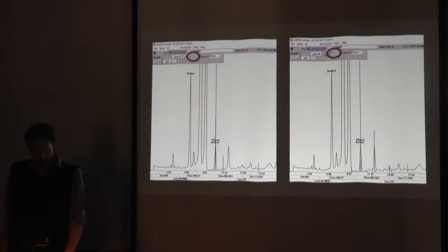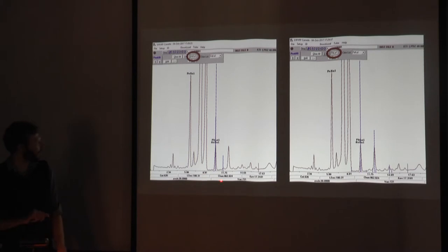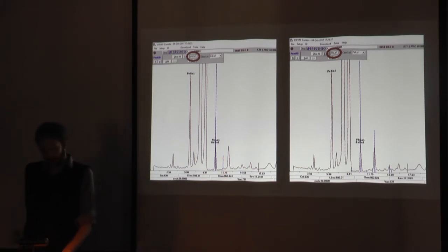These are blown-up versions of the same test shown in the previous slide. Unfortunately, the K-alpha of arsenic and the L-alpha of lead are only different by 0.01 kilovolts. Luckily, the K-beta peak of arsenic, which this blue line represents, shows us where it should be. This beta peak does not overlap with any other element, so arsenic is still detectable and relatively distinguishable based on the K-beta peak.